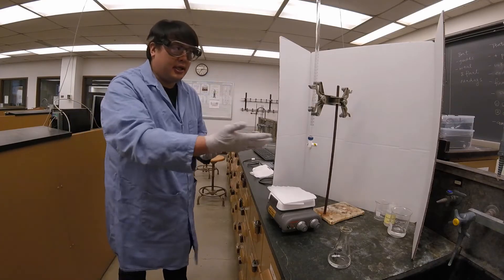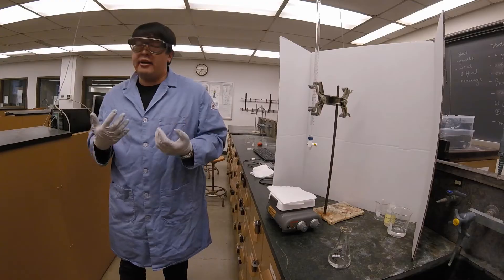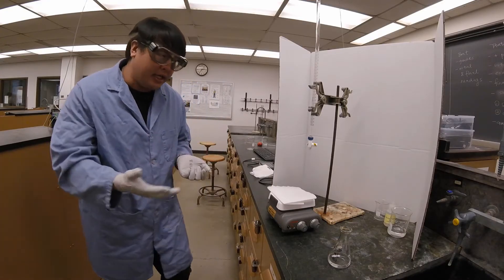However, as you can see, all the solutions are clear. So how is it that we can figure out when we've reached the endpoint? Well, we need to add an indicator.